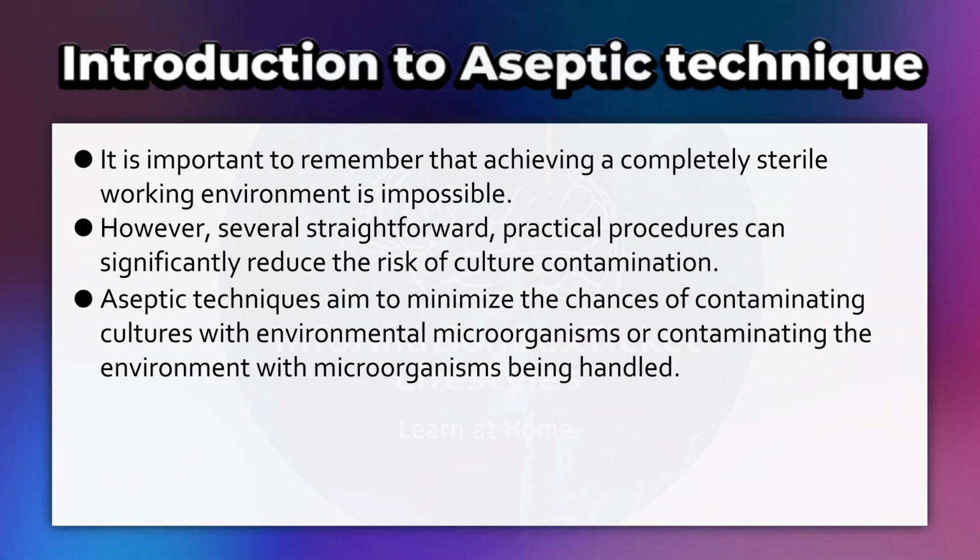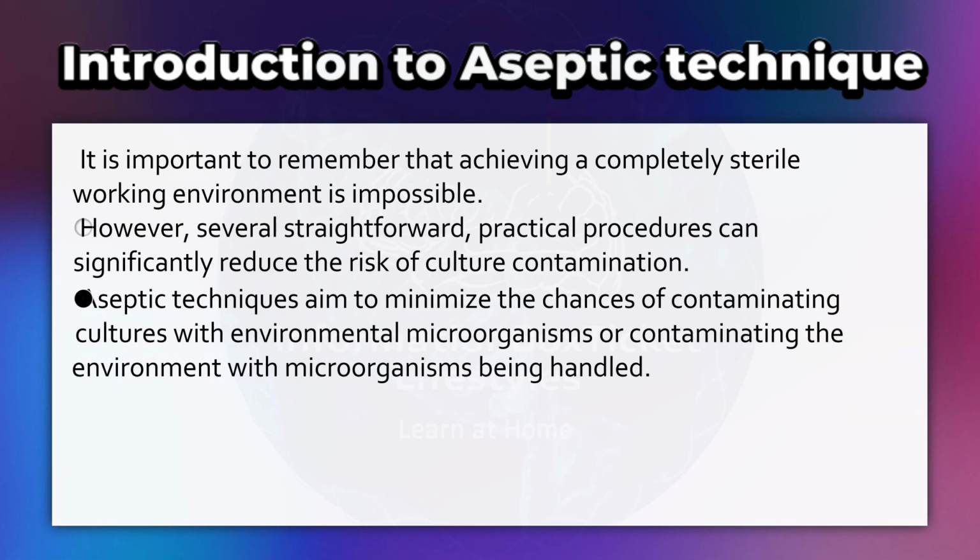Aseptic techniques aim to minimize the chances of contaminating cultures with environmental microorganisms, or contaminating the environment with microorganisms being handled.